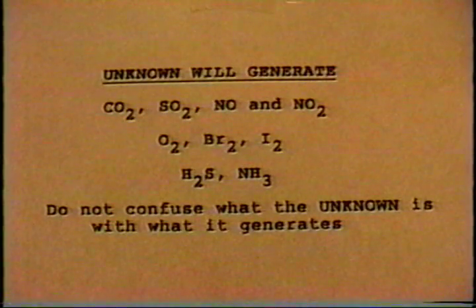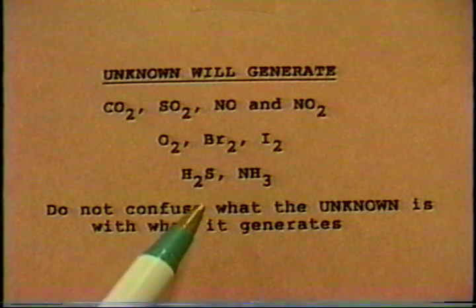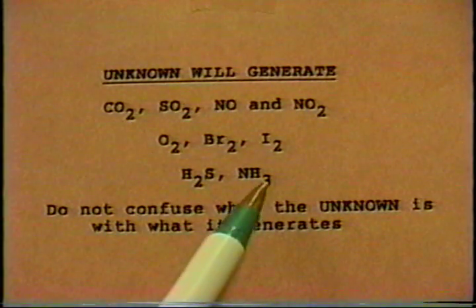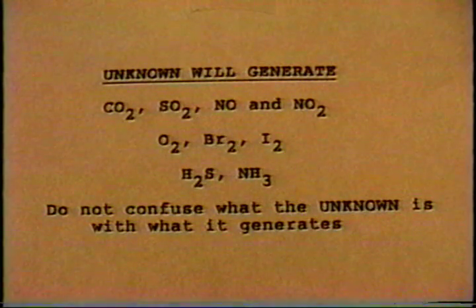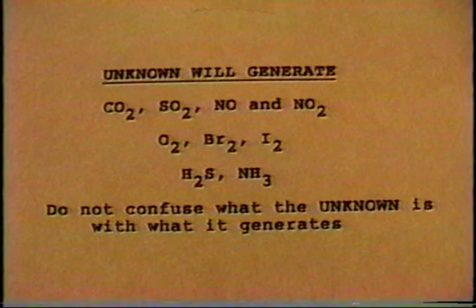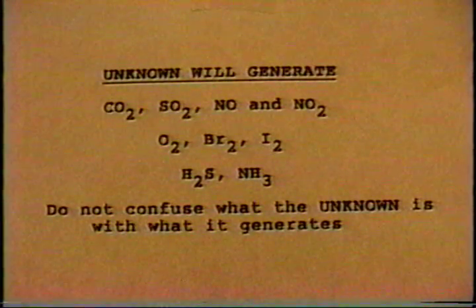In identifying it, you will generate one of these, except for thioacetamide, which will generate both hydrogen sulfide and ammonia. Do not confuse what the unknown is for what it generates. On the other hand, remember, what it generates will tell you what it is.